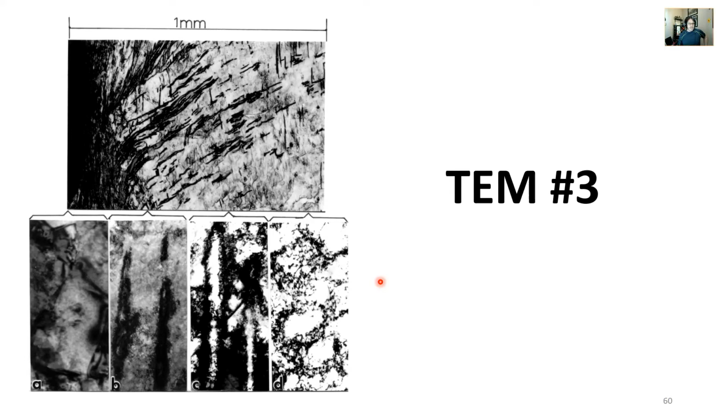There was a time where I was involved in a project. It was dealing with titanium, and you had two data sets basically, and they had pretty much the same grain size, but one data set had drastically different yield strength, and we did some TEM and found that there were more dislocations in the sample set with higher yield strength.